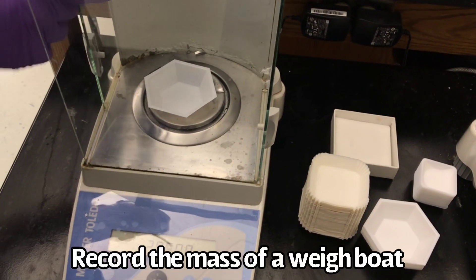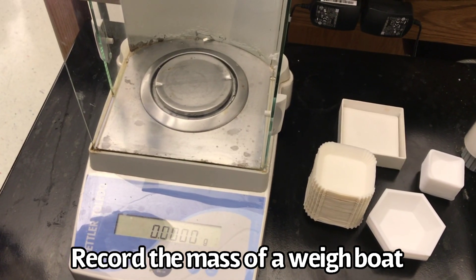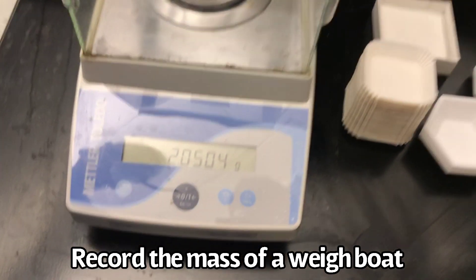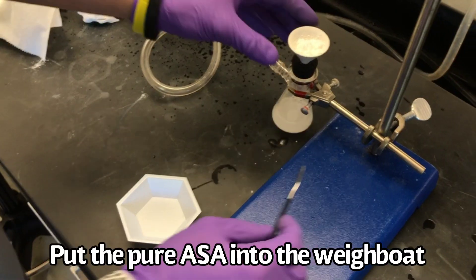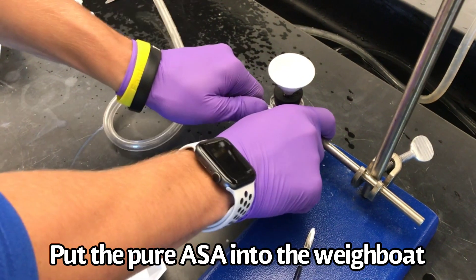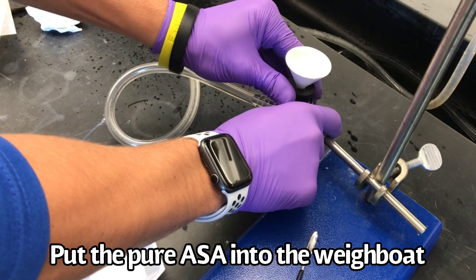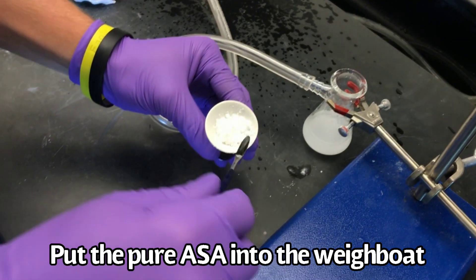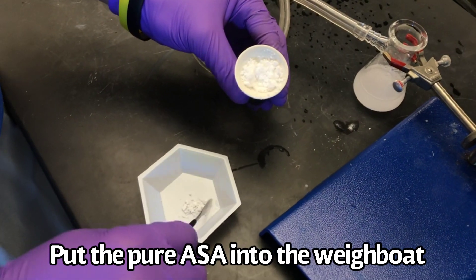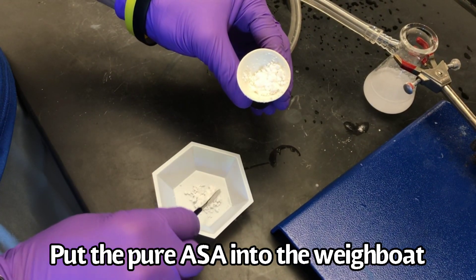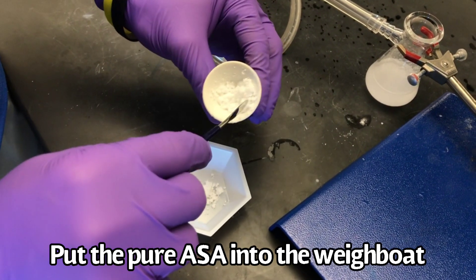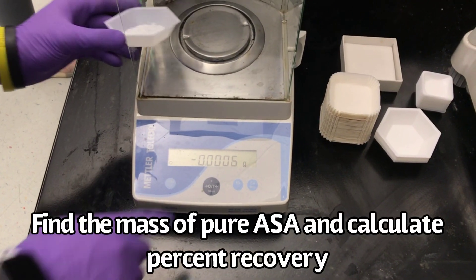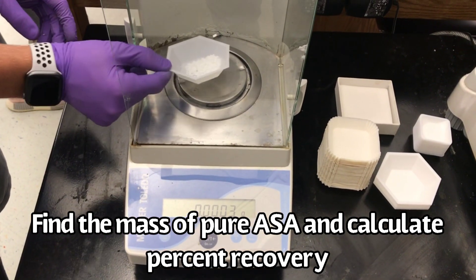Next, pre-weigh a weigh boat. Next, put the pure acetylsalicylic acid into the weigh boat. Find the mass of the pure acetylsalicylic acid and calculate percent recovery.